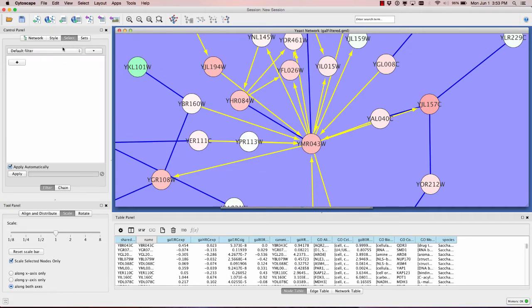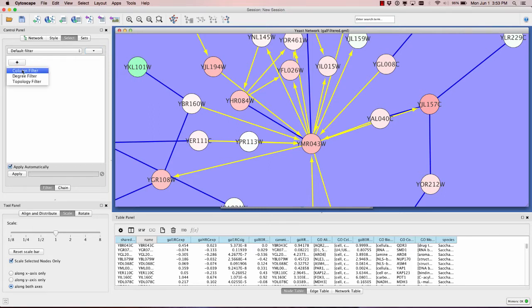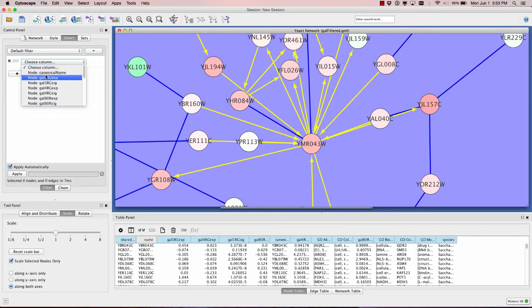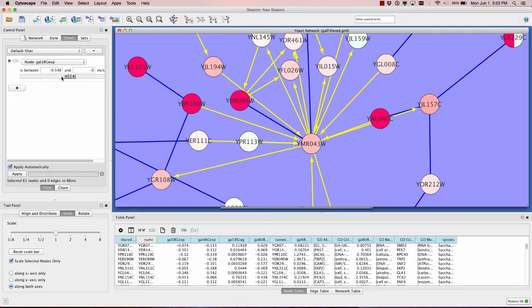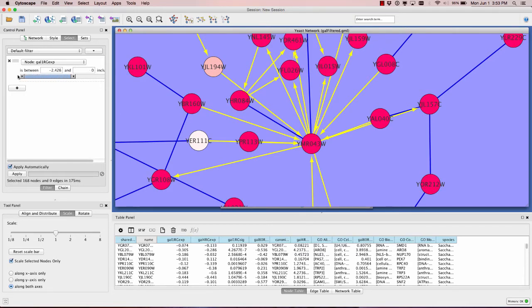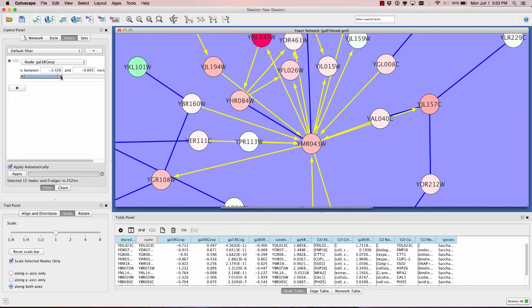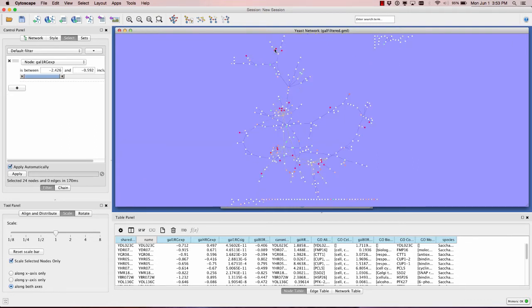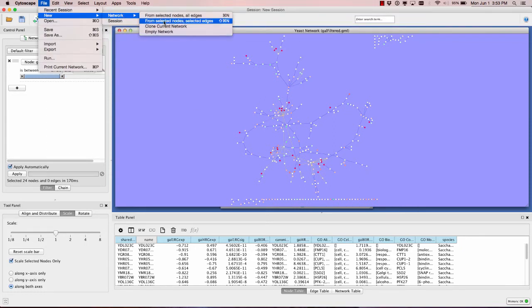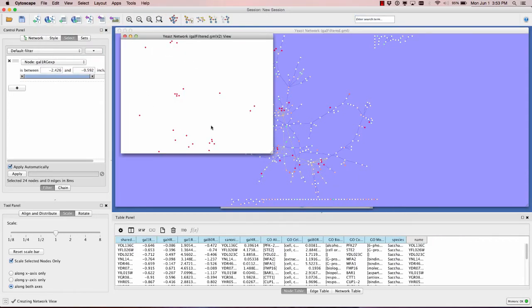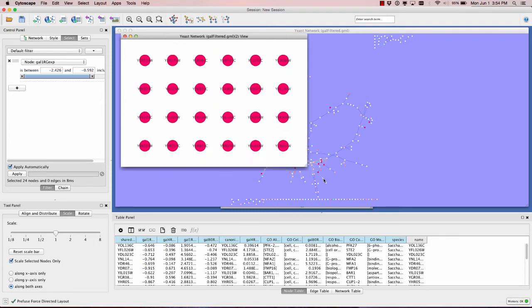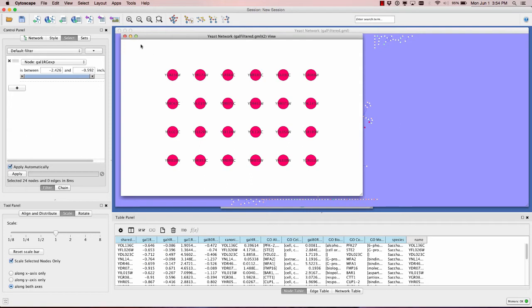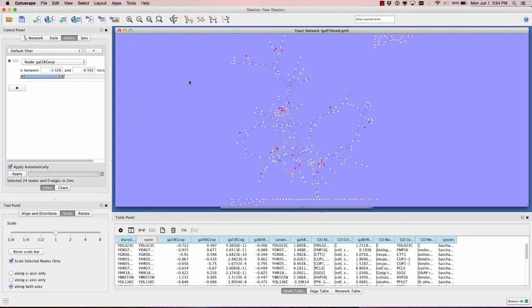One of the things I can do is go to the Select option and create a filter. I'll click the plus button and select gene expression that is negative fold change - so now all the negative fold change nodes are selected. I can make this more stringent to select only the really negative fold change ones. Then I can zoom out and see where those are - I've selected nodes in different places. If I wanted to move those to a new network, I could check how connected they are.